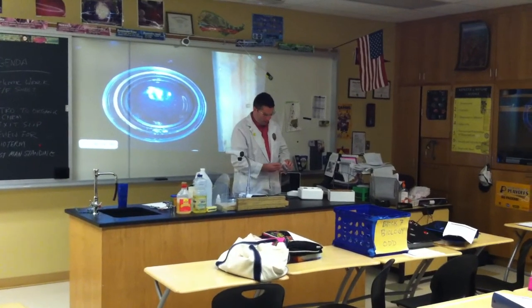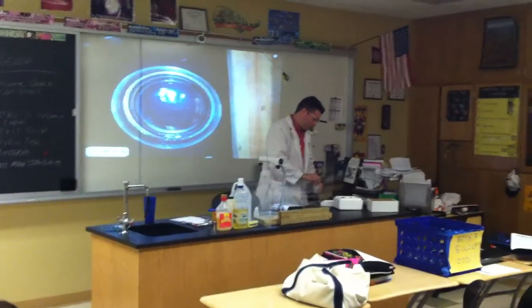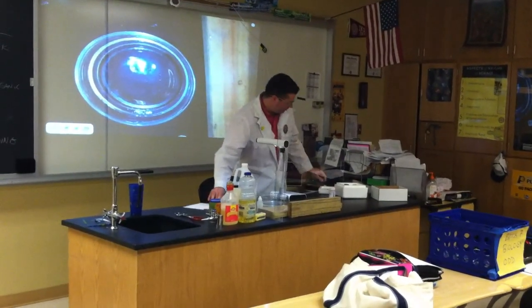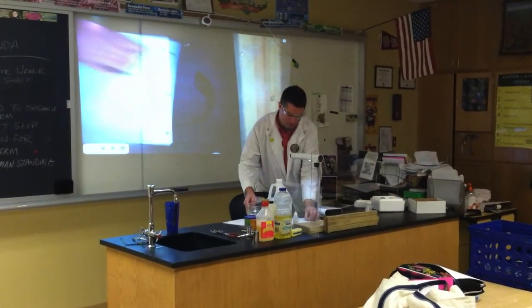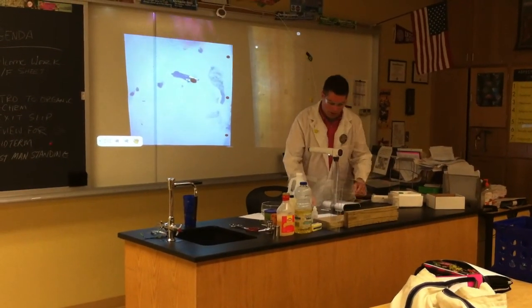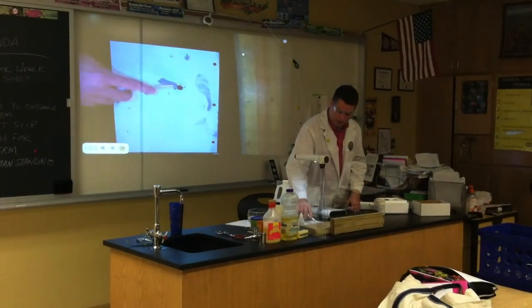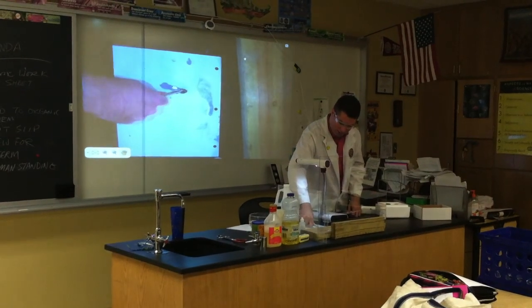So that being said, and with everyone's caution up, we're going to dump a couple of pieces out. And again, I'm only going to use a couple of small pieces. I want to show you guys what this looks like underneath the camera here. This is what lithium looks like in real life. So this is just all lithium atoms, and it's a soft metal. It's like butter. You can actually cut it with this spatula.